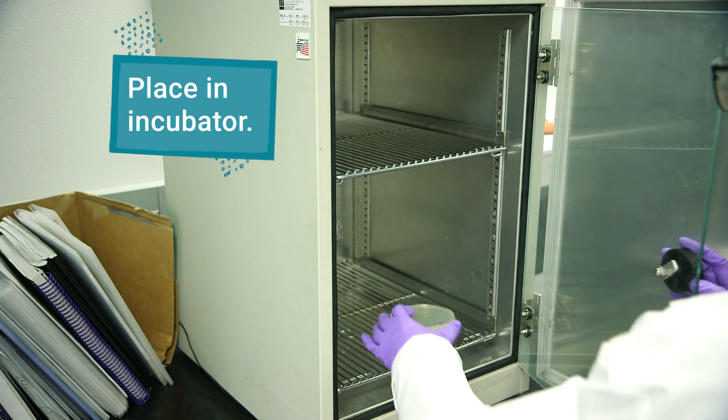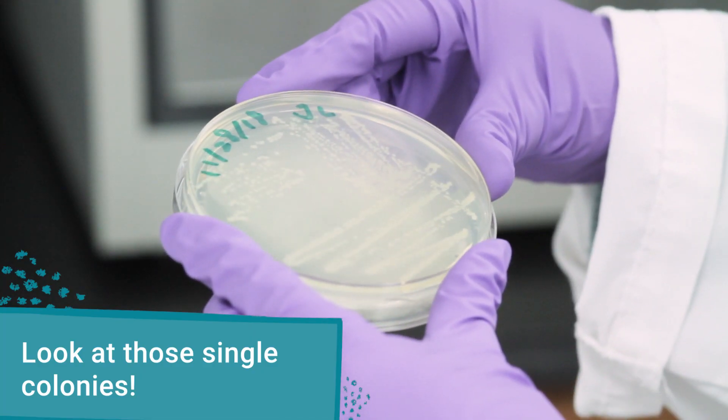Place your plate in the correct incubator. Tomorrow, you'll be able to see single colonies.